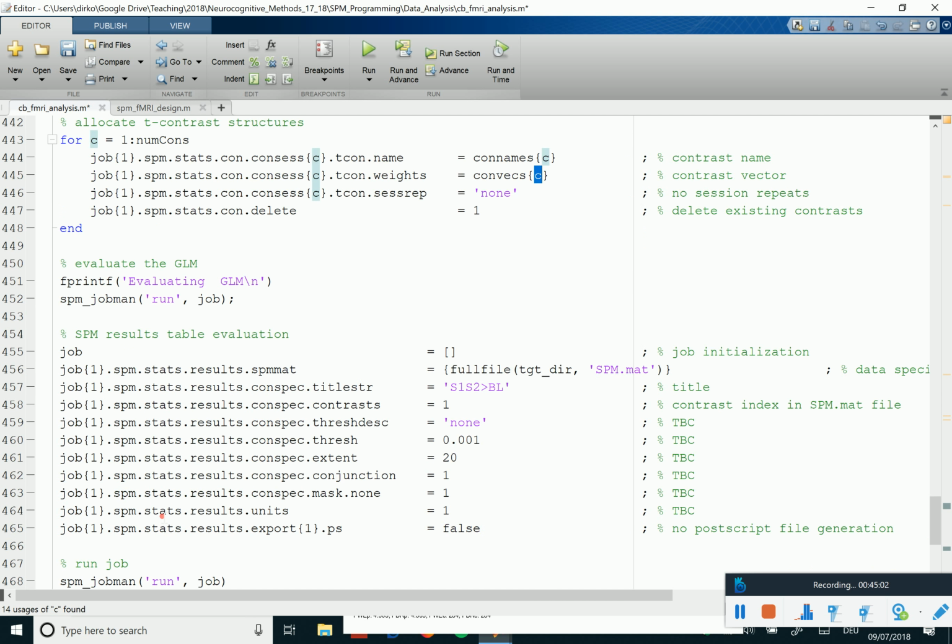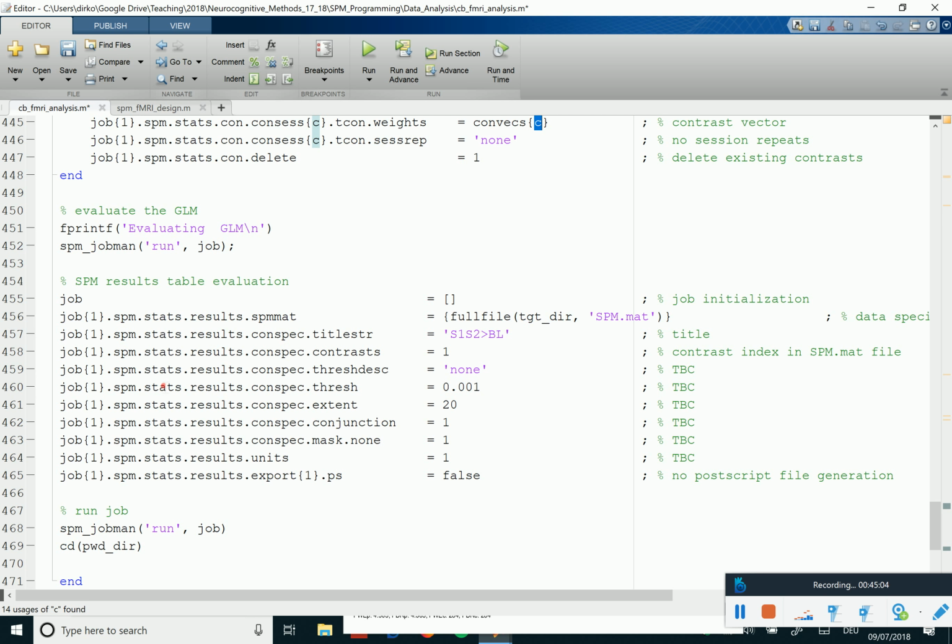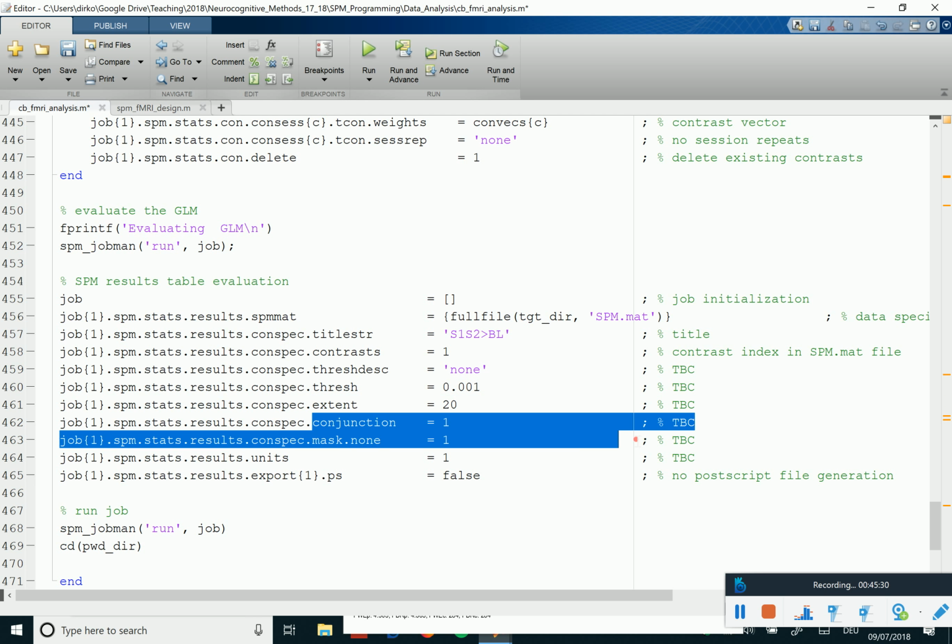And then one can also create the SPM result that we just did, and here you see that there are thresholds, and I didn't really write a comment yet because I wanted to clarify in the other course what these things really are, which I've done now. So at one point I can fill that in here.